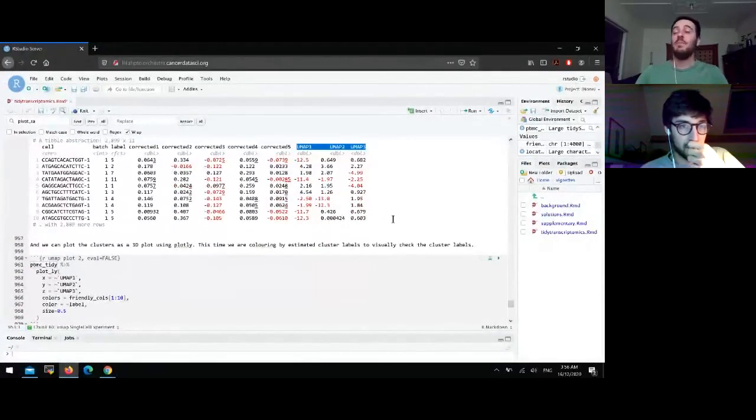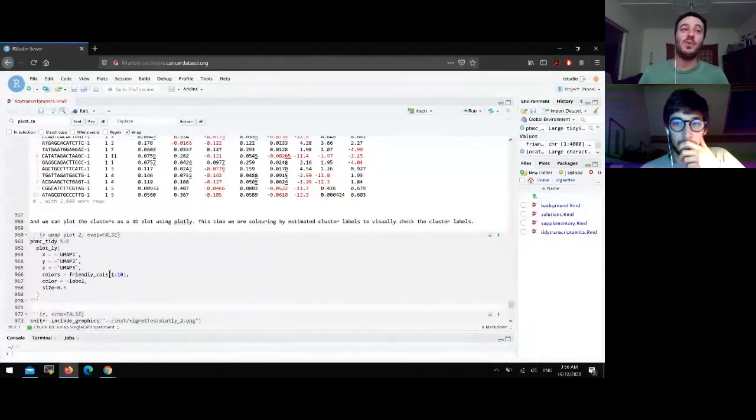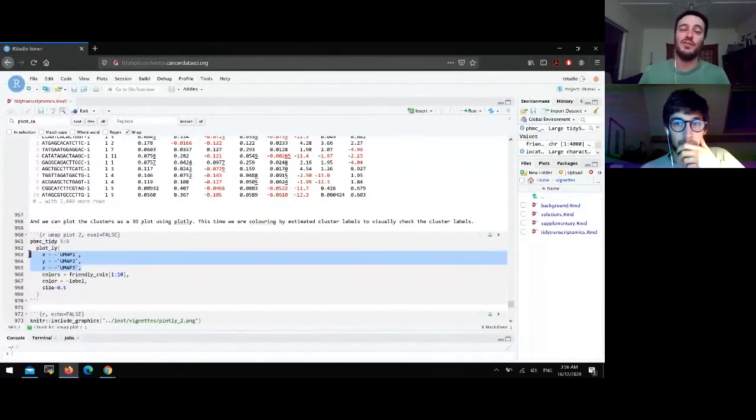Now, again, there are plenty of functions out there to build ad hoc scatter plots of the cells into, for example, 2D space. But let's suppose we want to go a bit out of the standard path and build customized plots. In this case, we want to build a plot visualizing the first 3 dimensions, not the first 2.